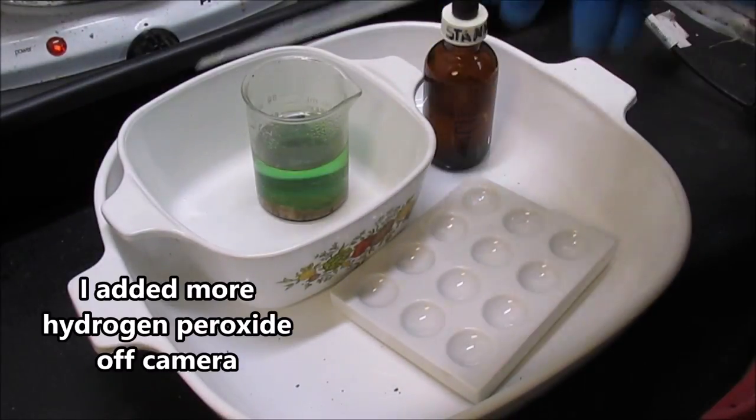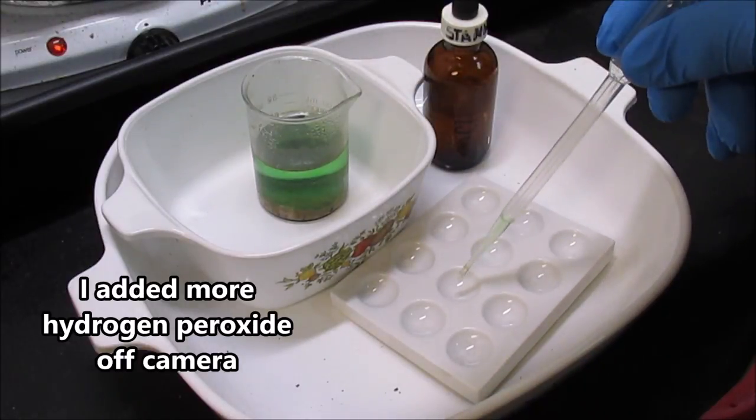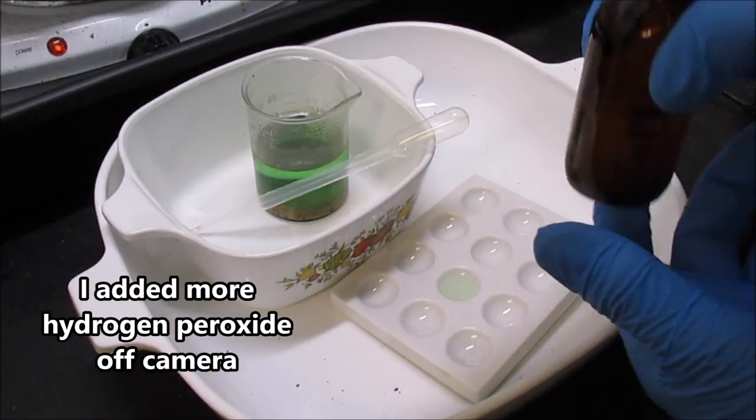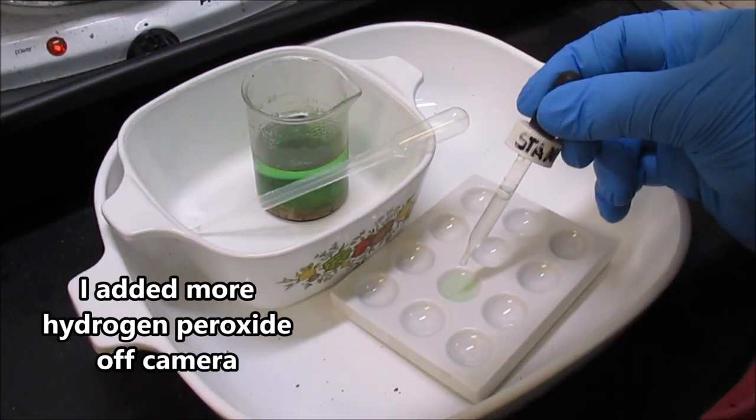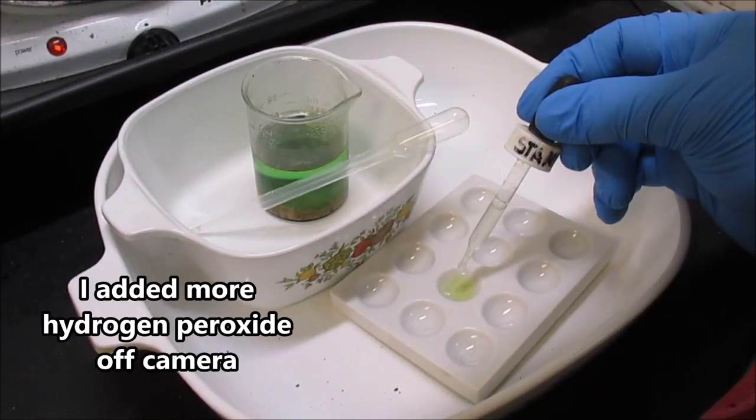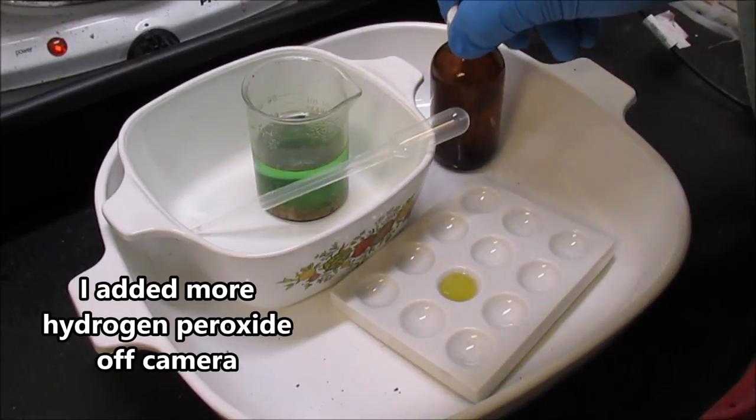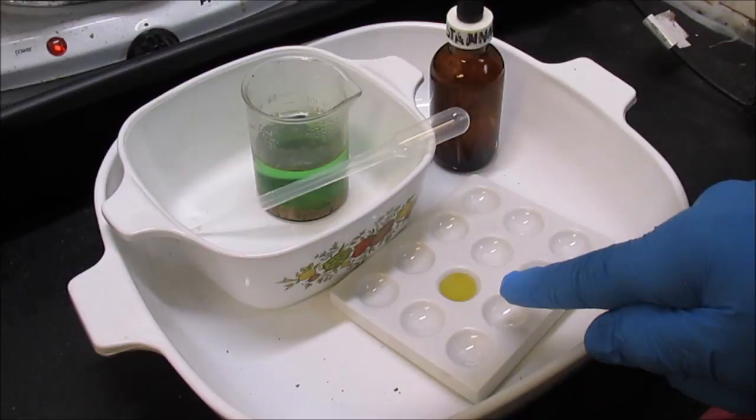Now I'm going to test our piranha solution, see if I got metals going in solution. Put some in a spot plate here, got some stannous chloride testing solution, a few drops of that in there. And as you can see that piranha solution caused some metals to go into solution, looks like platinum, probably some palladium with it.